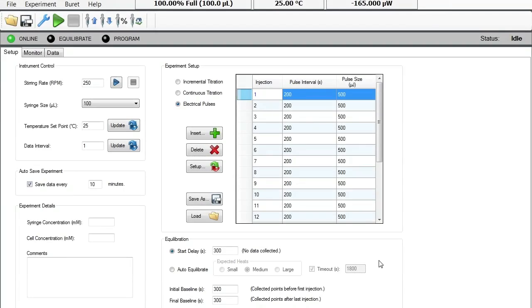To perform an electrical calibration on your nano ITC, the first step is to ensure that your instrument is absolutely clean and then fill the reference, the sample cell, and the syringe with degassed, deionized water.